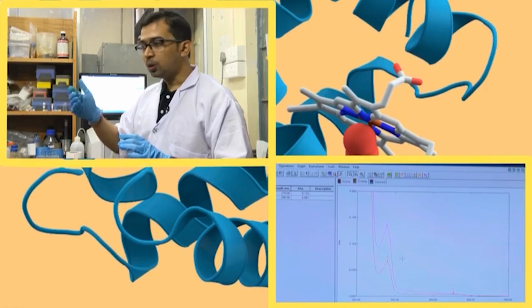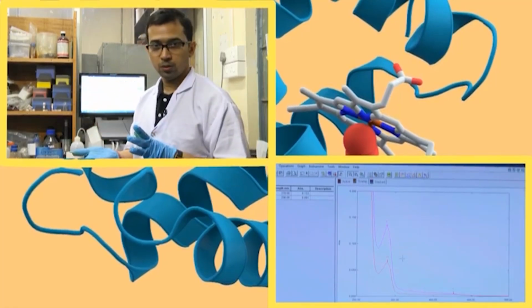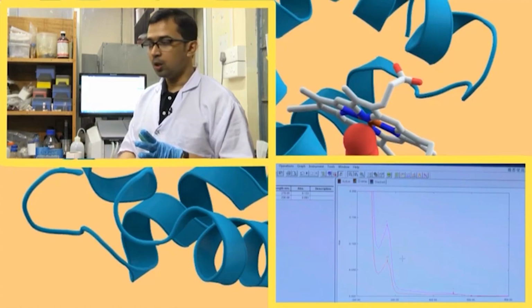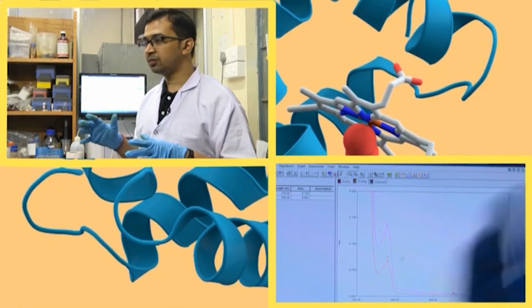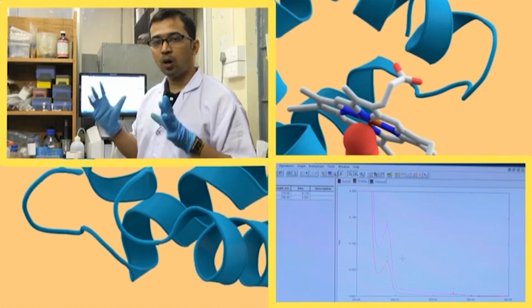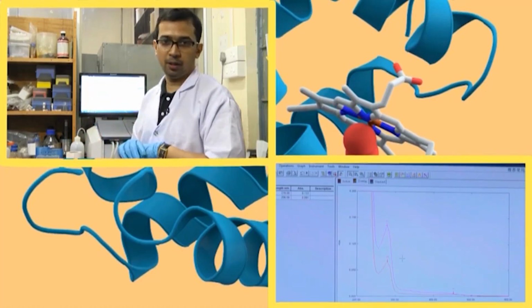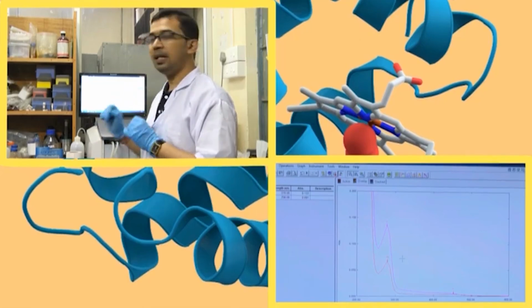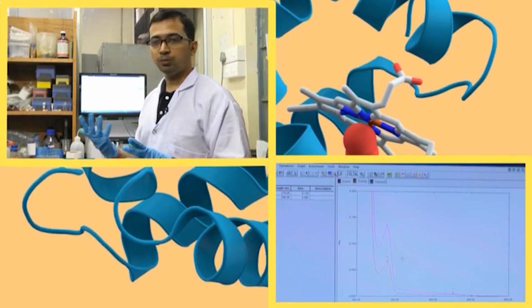Okay. So, the curcumin within the solution, this unbound curcumin might settle down into the bottom of the cuvette. What happens in that case is that the entire solution may not be available for absorbance measurement. So, that might lead to some error also out here.